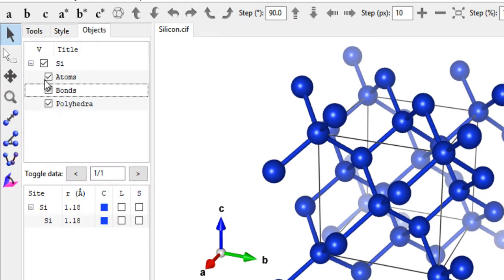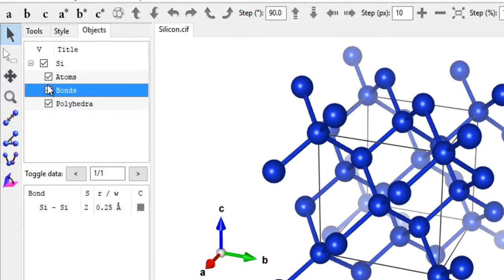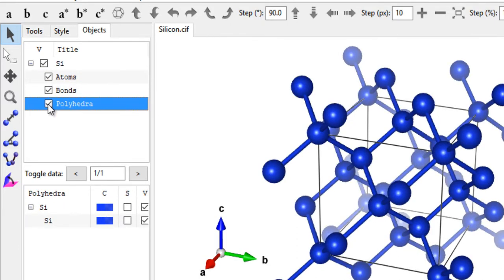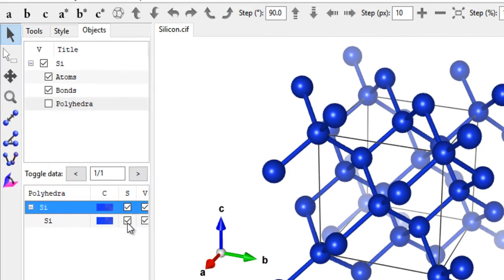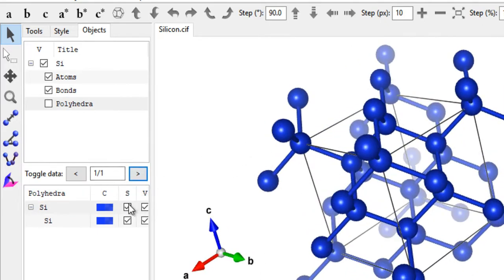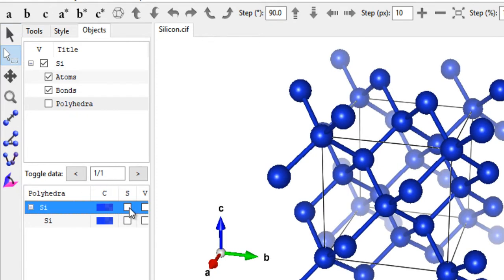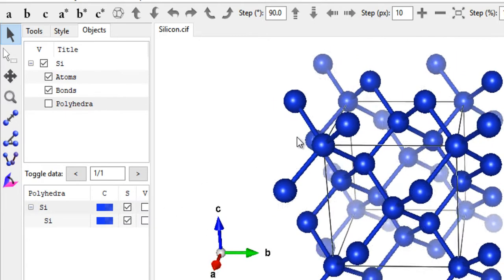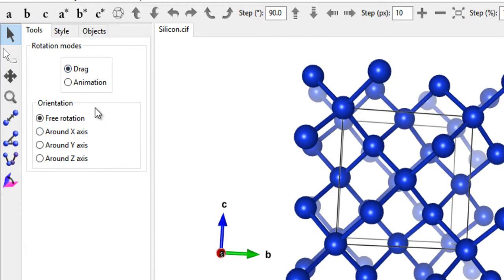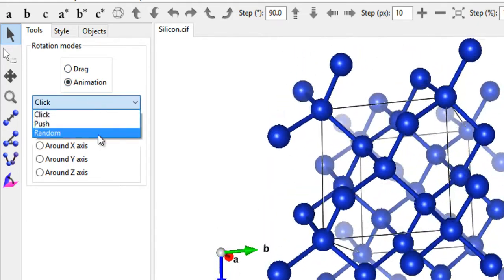Going to Objects, you can control what elements are displayed. If you don't want to see bonds, uncheck that option. If you don't want to see polyhedra, uncheck that. You can also attempt to select all atoms at once by clicking here, though this feature didn't seem to be working during this recording.